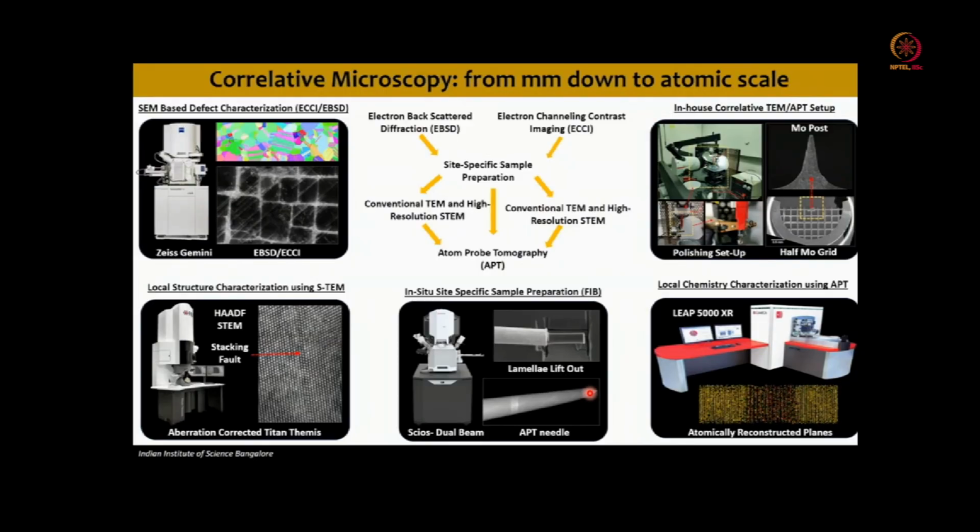Then we performed sample preparation from those locations. We confirmed by using high resolution electron microscopy in TEM, and subsequently on the same samples we performed the chemical analysis locally at atomic scale by using atom probe.